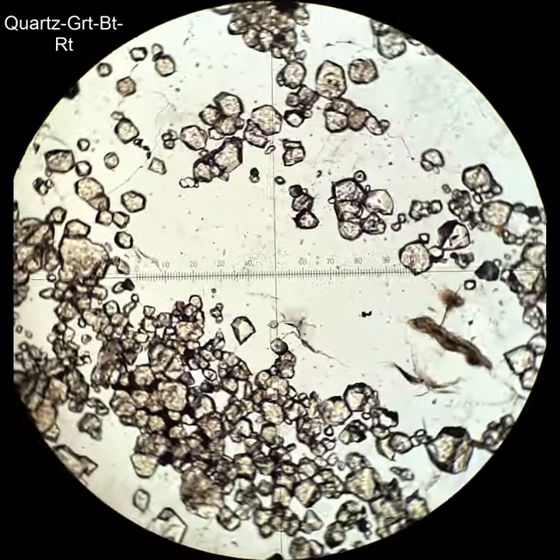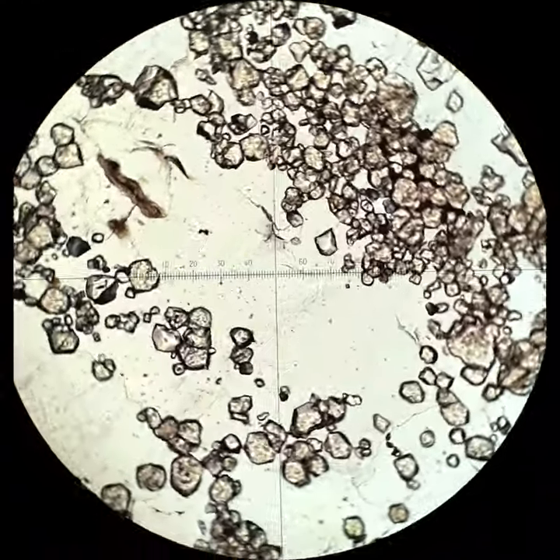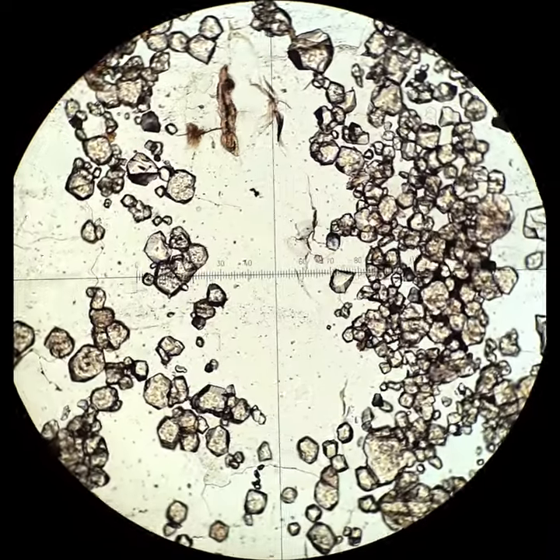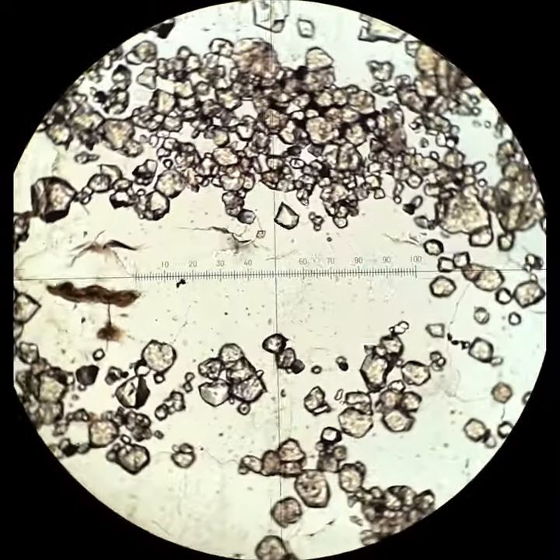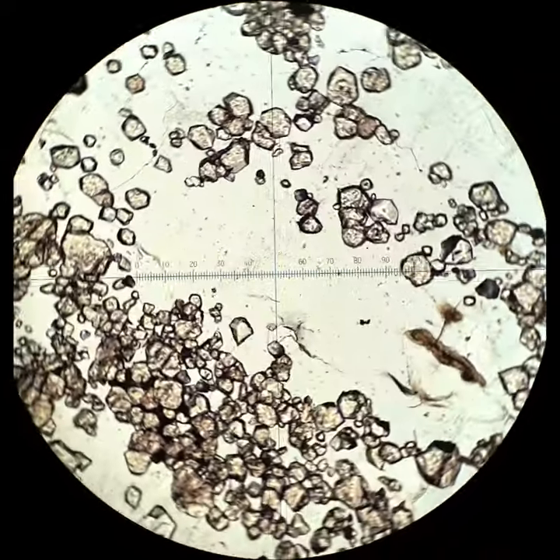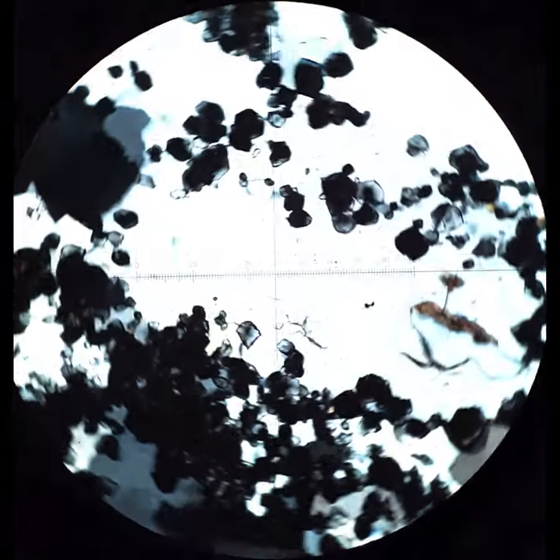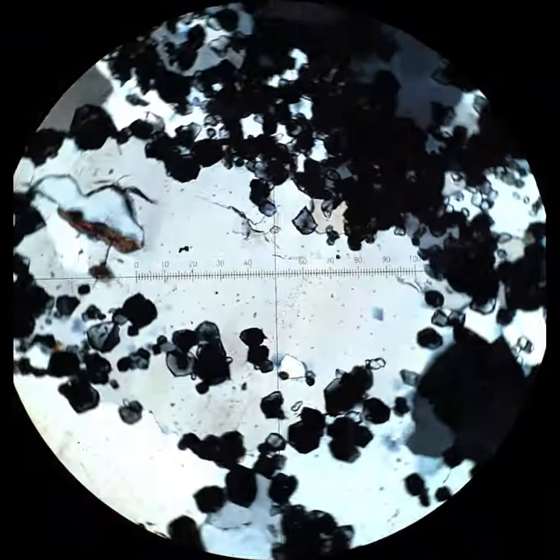This is another garnet quartzite, and what you'll see as the polars are crossed is that it has started to break up into different sub-grains. This is really typical texture for quartz — it'll develop these different domains that are almost the same orientation, but not quite. So it almost all goes extinct at the same time, but you can see some variations from one side of the grain to the next.